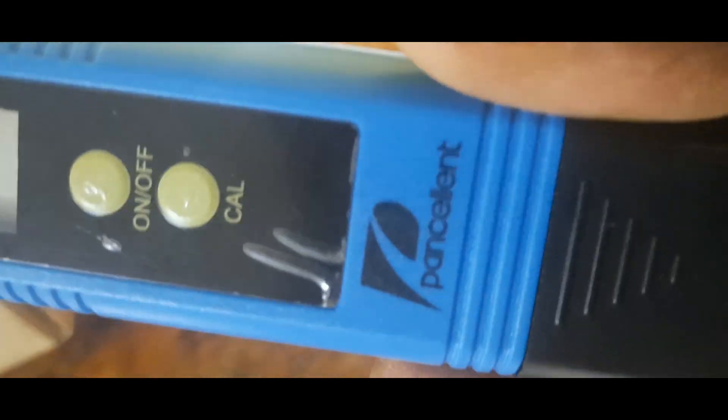Now heading back to the box for the second one — this should be the pH meter, which I think is my main one. This should be able to test all different types of water. I like how it looks. There's a little grip — it can be stuck in the pocket like a pen. There it is. It reads 1.5 and I will have to do some calibrating. This is the pH meter and it does quick tests.